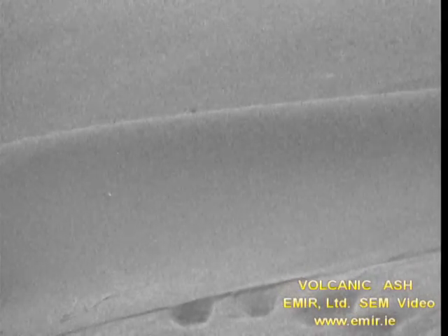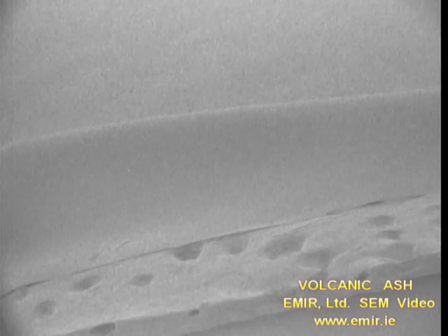As the magnification decreases and the field of view increases, more of the black ash particles can be seen to better reveal the scope of the big problem that was created by the large number of these tiny particles that drifted from the volcanic eruption in Iceland to finally settle all over Western Europe.